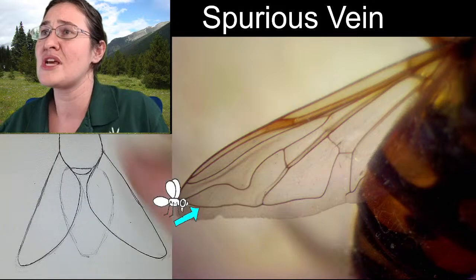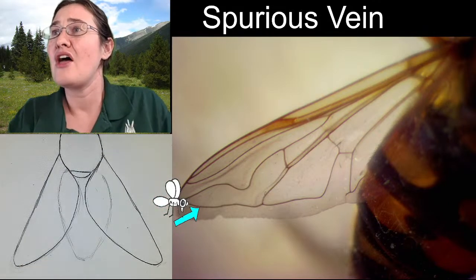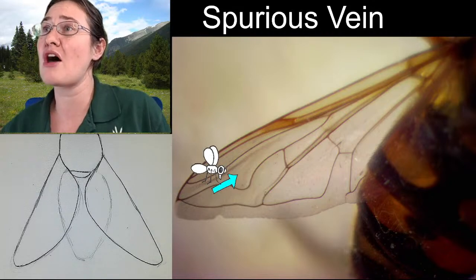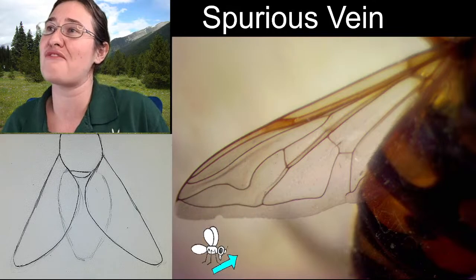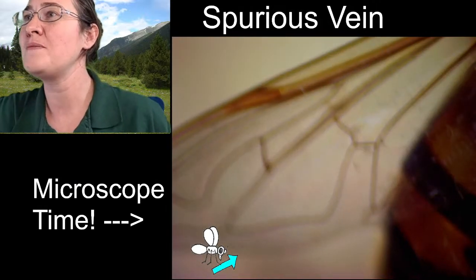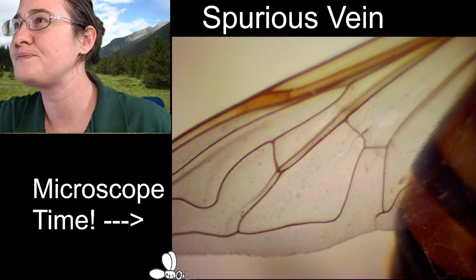Now, with flower flies in the family Syrphidae, the one characteristic that is the same over and over and over again is what we call the spurious vein. And you would think that it's this beautiful little wave thing. That is not the spurious vein. Let me go ahead and zoom in on it for you, because in this specimen, it's a little low.